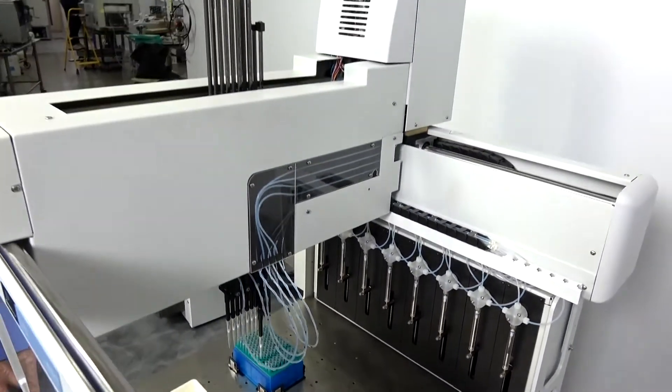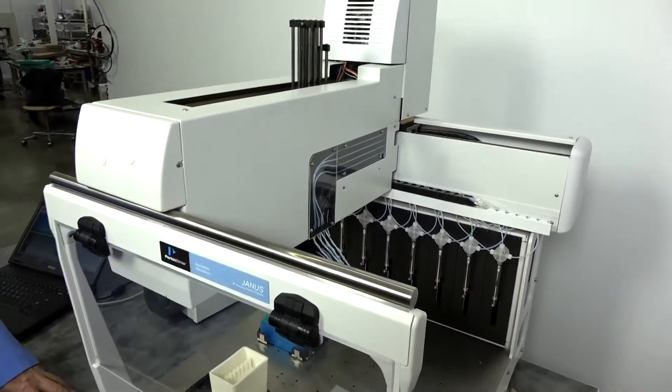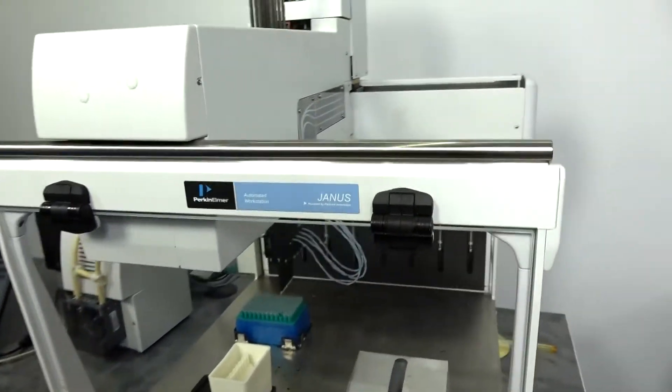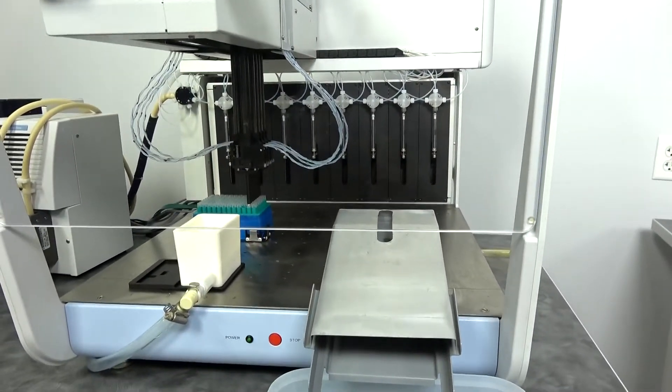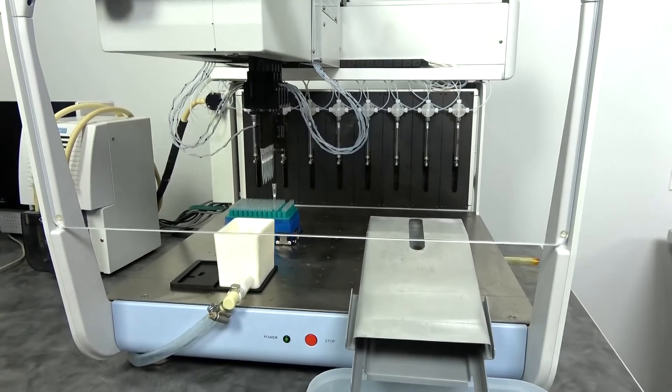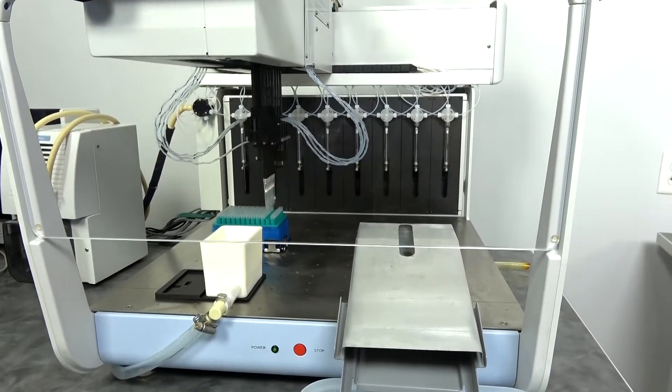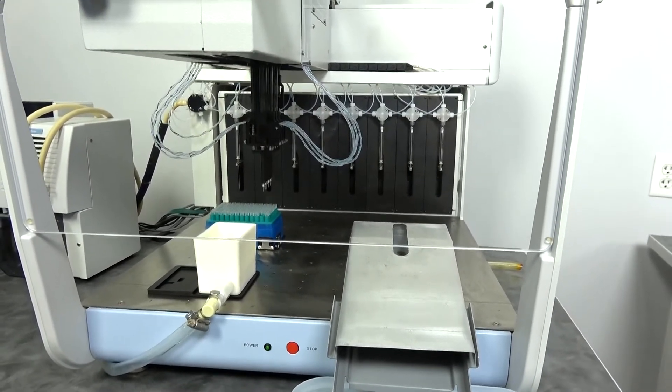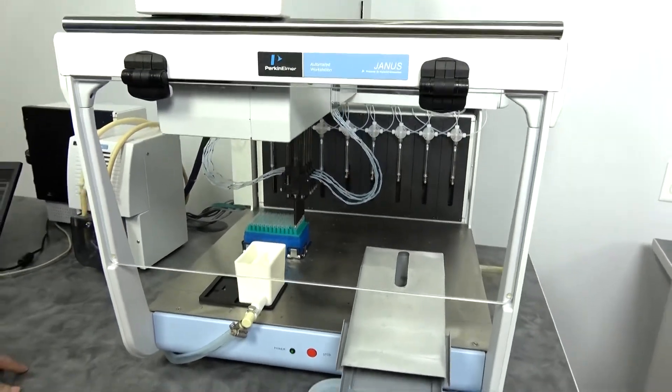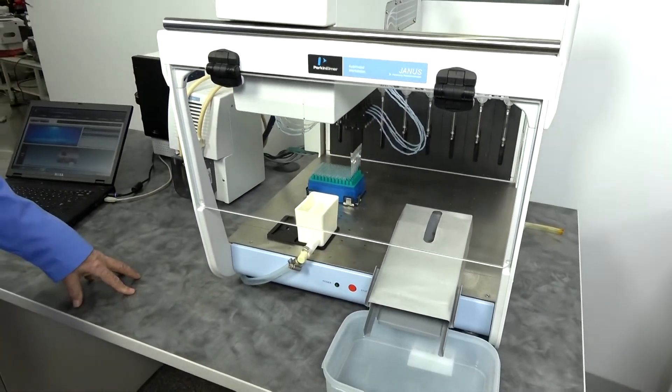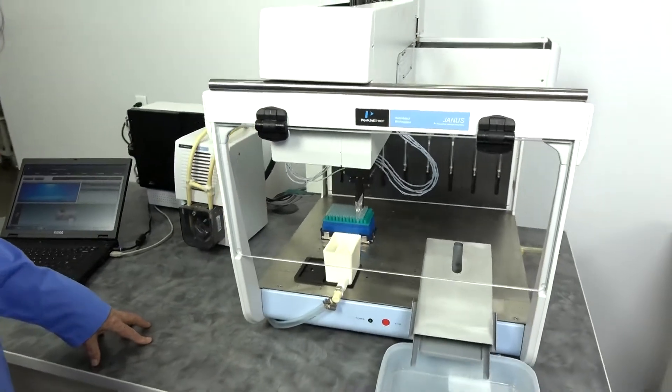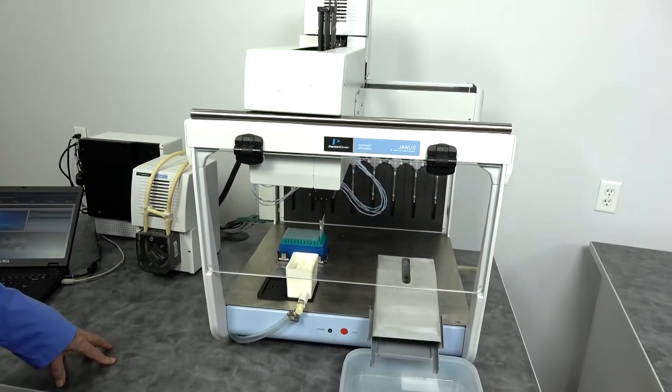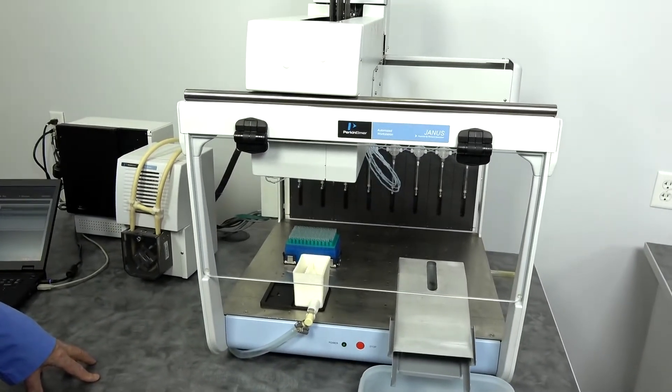Although we do have some deckware available, we don't have everything that is available for it. Also, there are different size syringes in case you have large or minor volumes. It's paired with the proper size syringe so you get a very exact count.